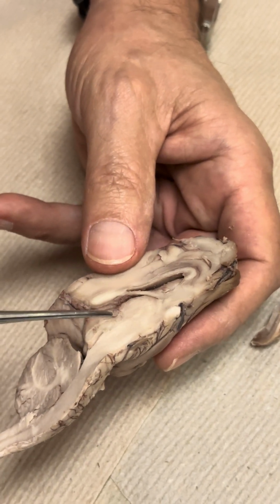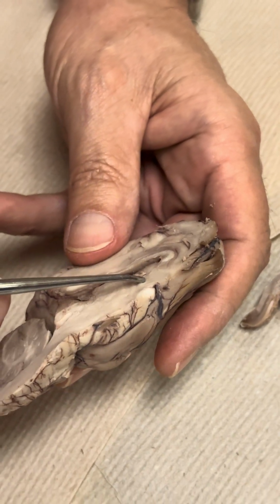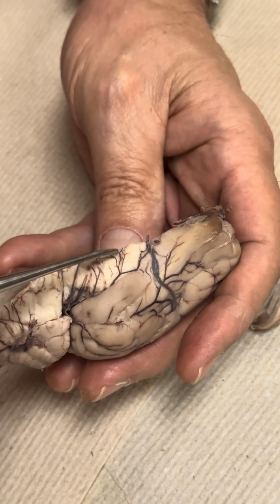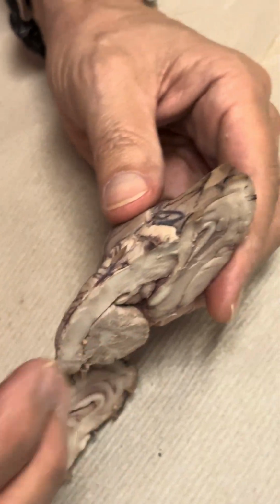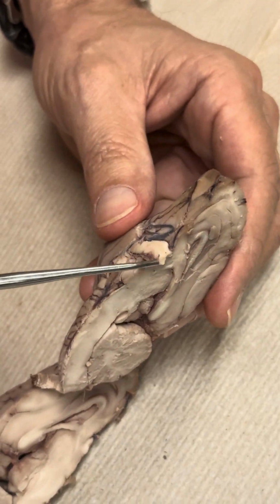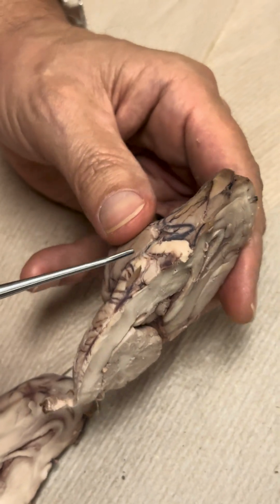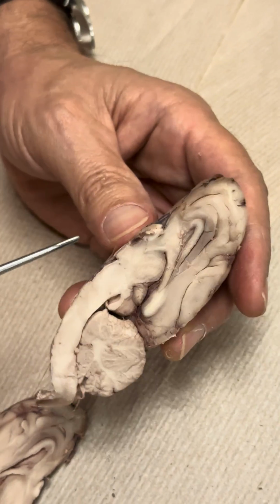They're on both sides. All right, you have the optic chiasm just below the hypothalamus. Just posterior to that, you can't see it on this one. Let's see if we got a better one over here. Not really, because this is the chiasm, this is the optic tract. Oops, that's not even that. Yes, it is. The optic tract.